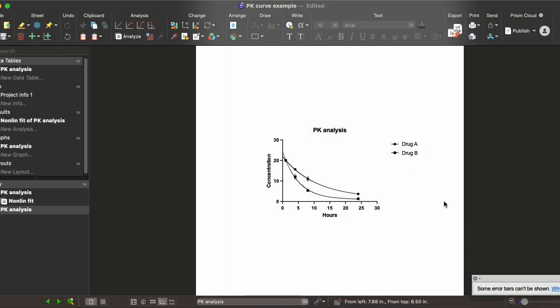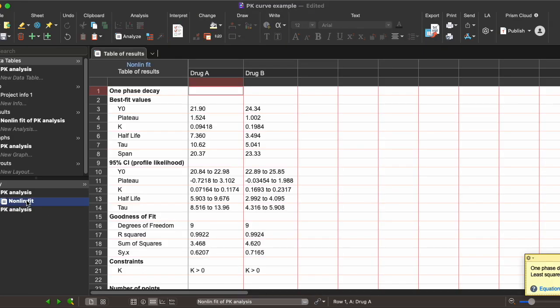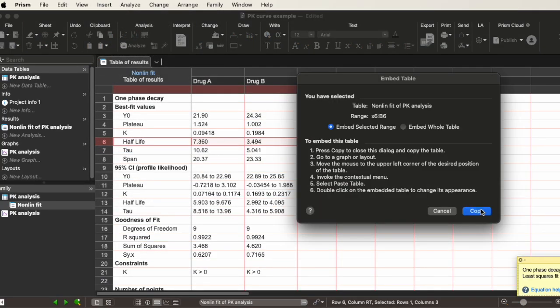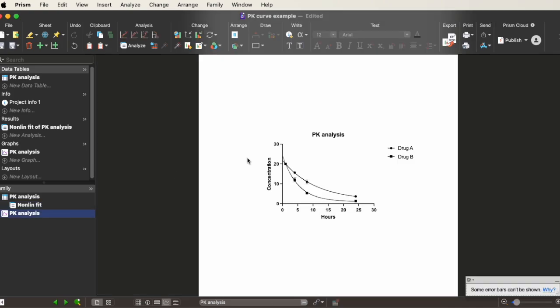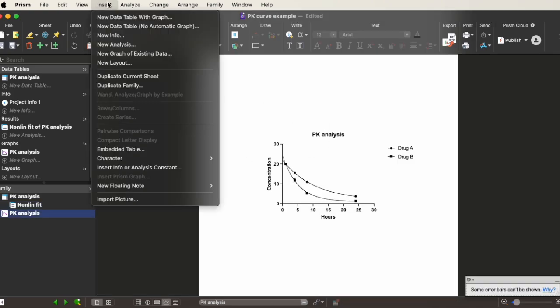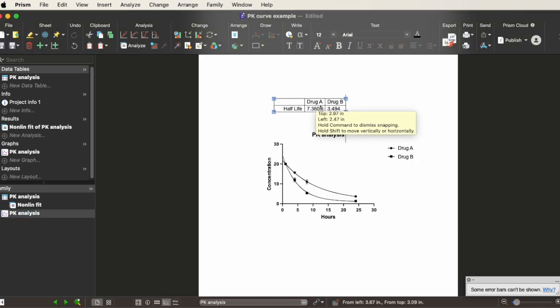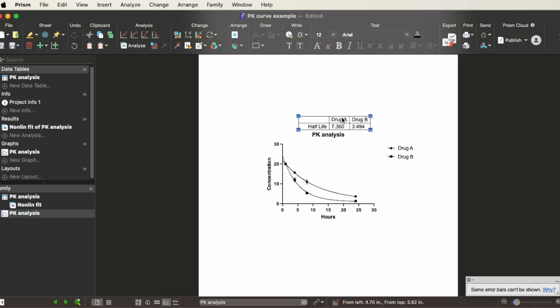If you want to display the half-life or decay values on the graph itself, a nice way is to go directly into the table of results, select half-life for your two data sets, go to Insert Embedded Table, copy, go back to your graph, Insert again, back to Embedded Table, and then paste. That will give you a nice little table to show whatever results are important for your case.